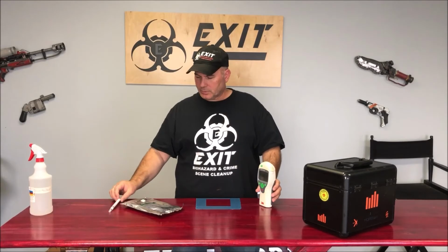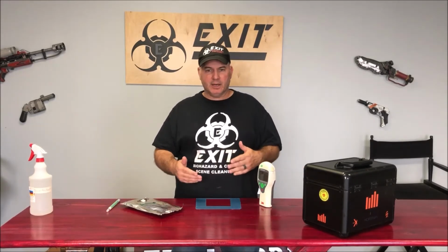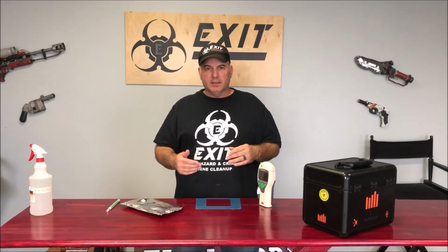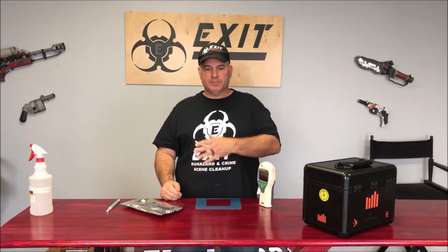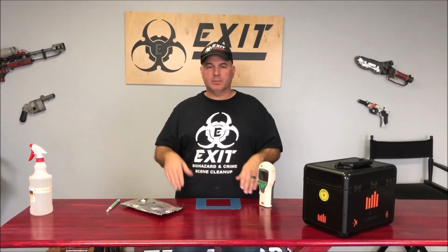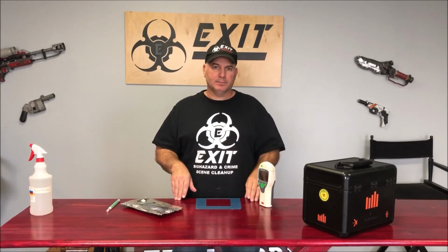So it's good to start with a before and an after kind of thing. Now when I say before, granted we do a blood and tissue and things like that. I'm not saying obviously don't do that. Don't stick it in the mess, okay? But it's just a general tool to have so we can see if we're doing better or worse. So I'm gonna use some disinfectant here and see how we do, and I'll come back.